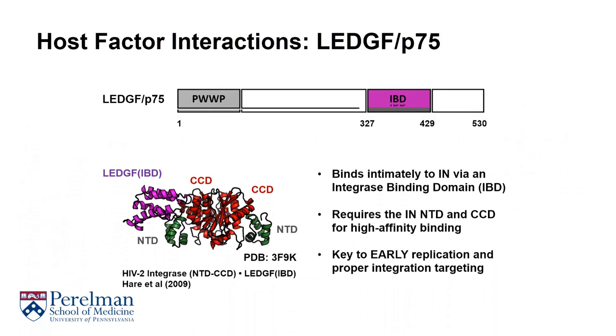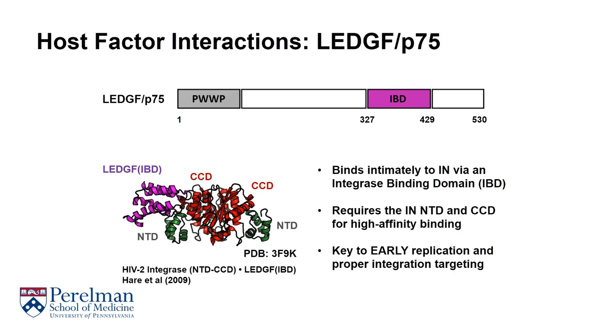SEC-MALS had similar utility in our study of HIV integrase host factor interactions using small-angle X-ray scattering. The host factor LEDGF/p75, that is lens epithelium-derived growth factor, has a modest five-helical bundle, colored here in purple, called the integrase binding domain because of its high affinity interaction with the catalytic core and N-terminal domains of the integrase, shown in red and green. This is a functional interaction very important to the integrase function and the viral life cycle.